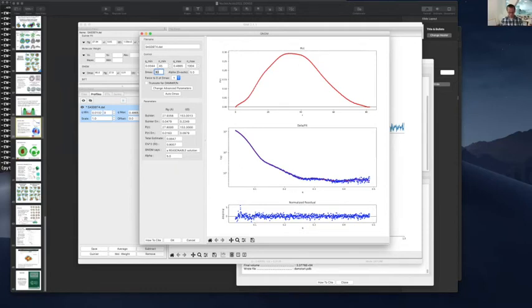You can also give it a really big number, and what that'll do is it'll show you where it naturally wants to go to zero, and then you can pick that as well. So we'll set it at, I think it was 85 or something like that, right? So this is typically fine.